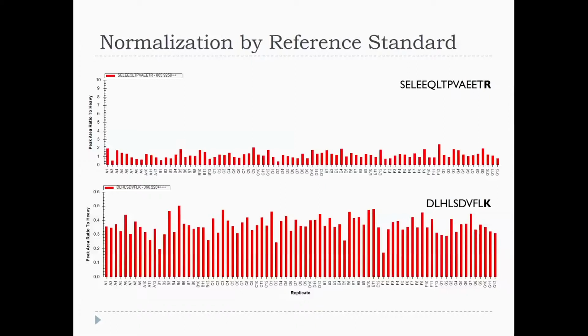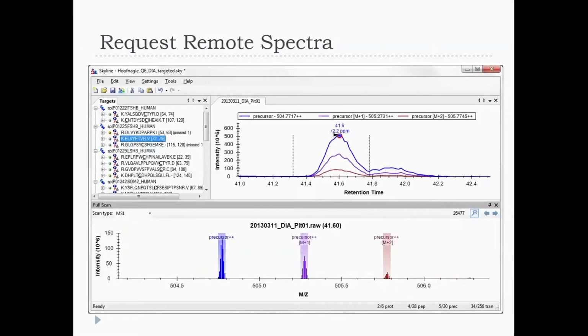So are either of these biomarkers? Wow, that was an easy question. No, there's no variance across all of these. I guess if you were to say maybe these are all diseased, but no, it wasn't. Okay, so a new plot inside Skyline.